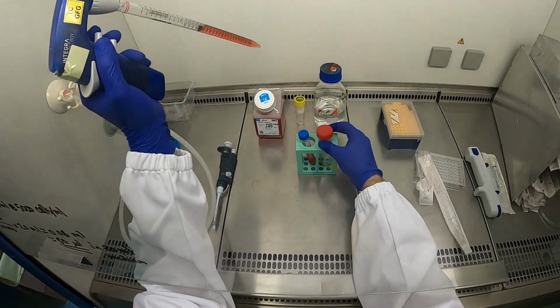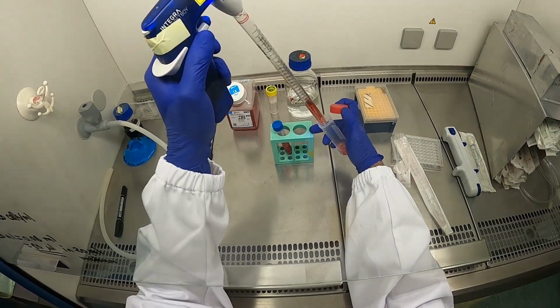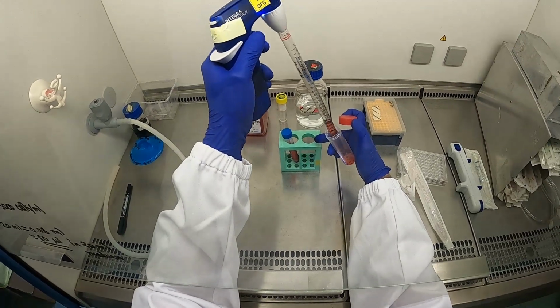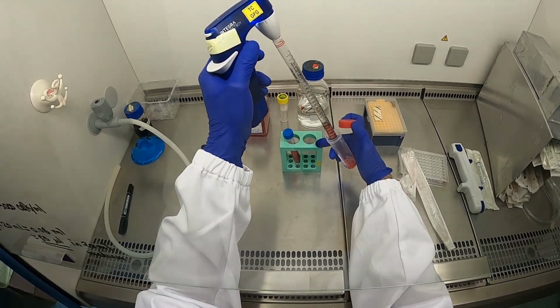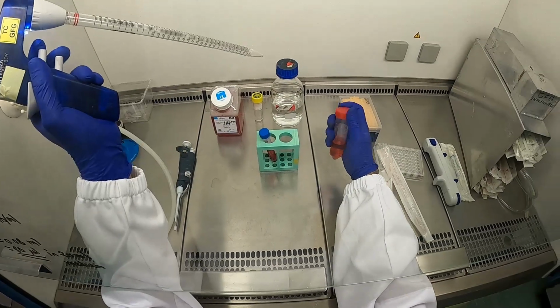And add the 20 ml of medium to the tube. Mix a little bit by pipetting up and down. And that should give you a 20 ml cell suspension of 5,000 cells per ml.